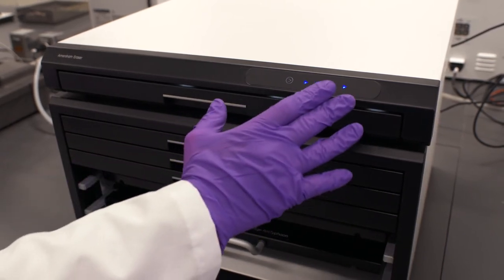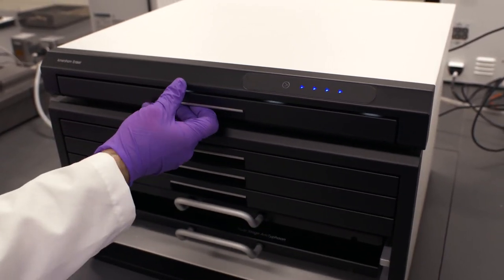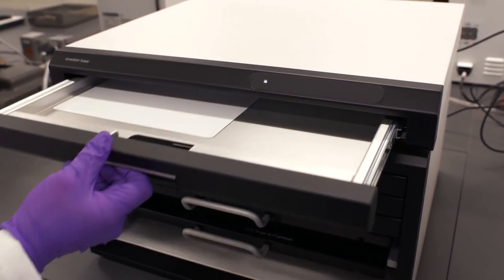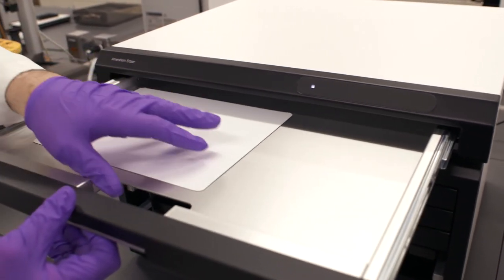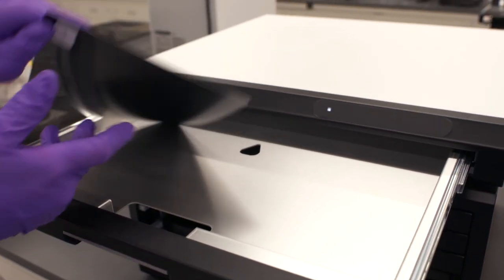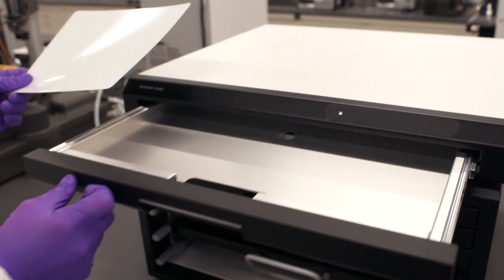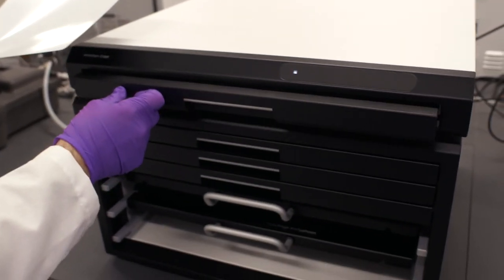Once it's finished these lights will go off we can then open the drawer. We can then take out our screen, take that over to our exposure cassette and expose it to our sample.